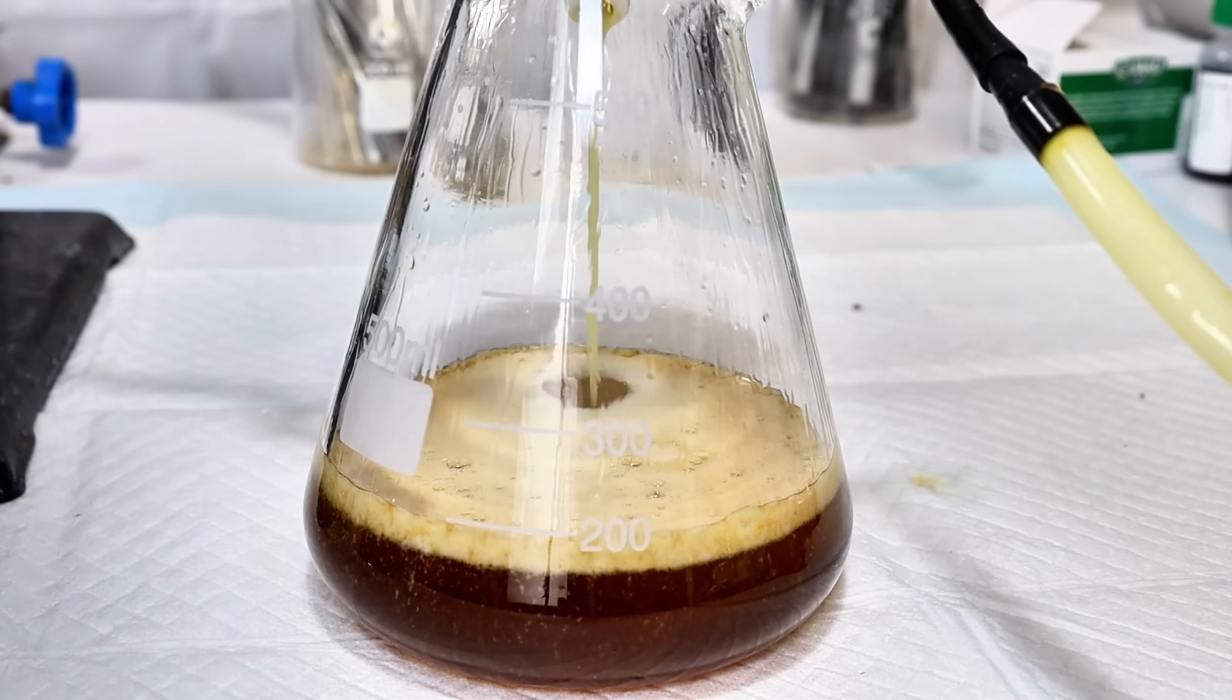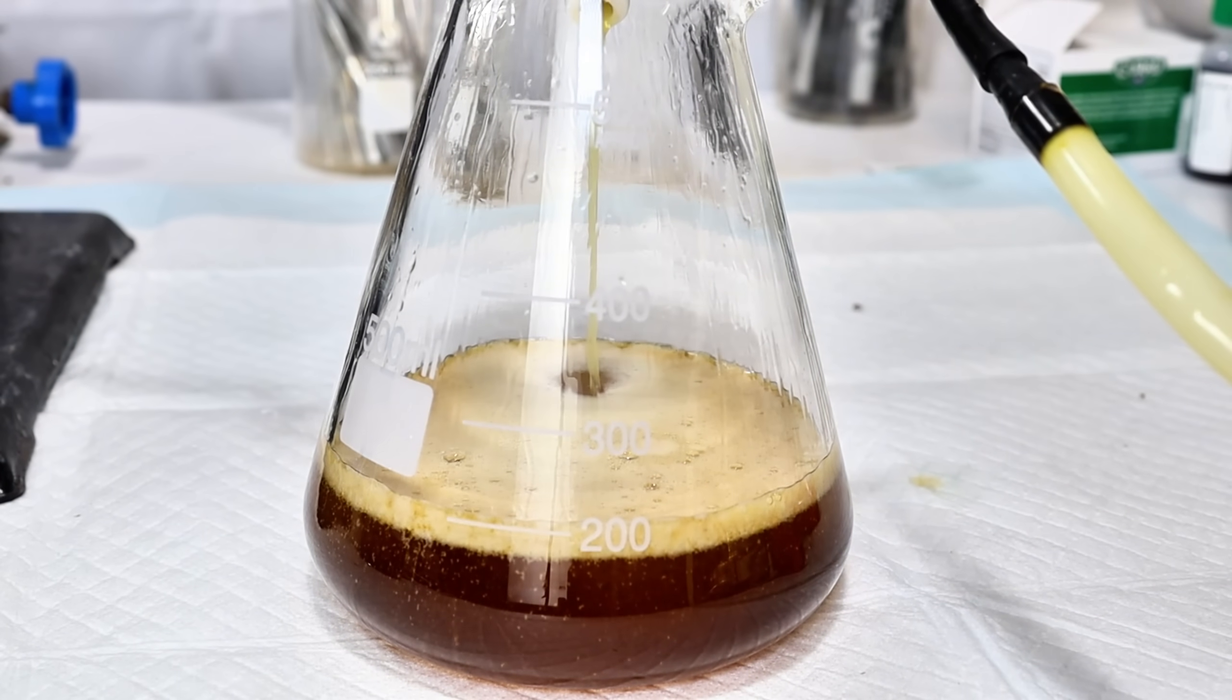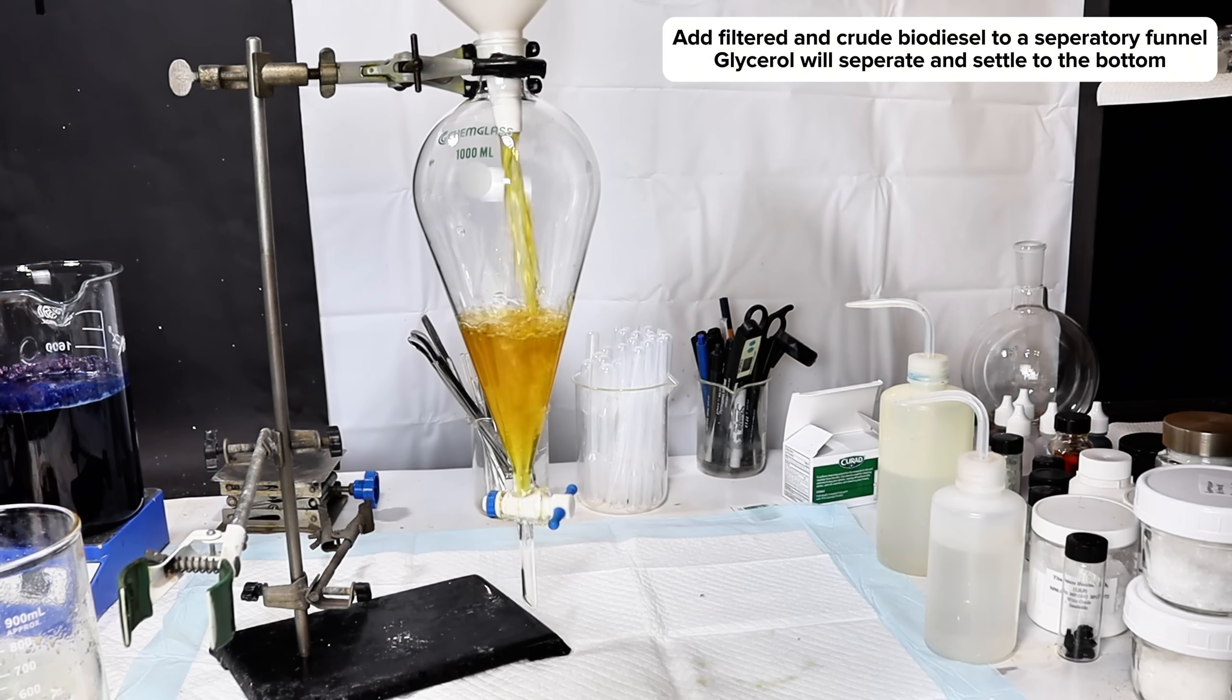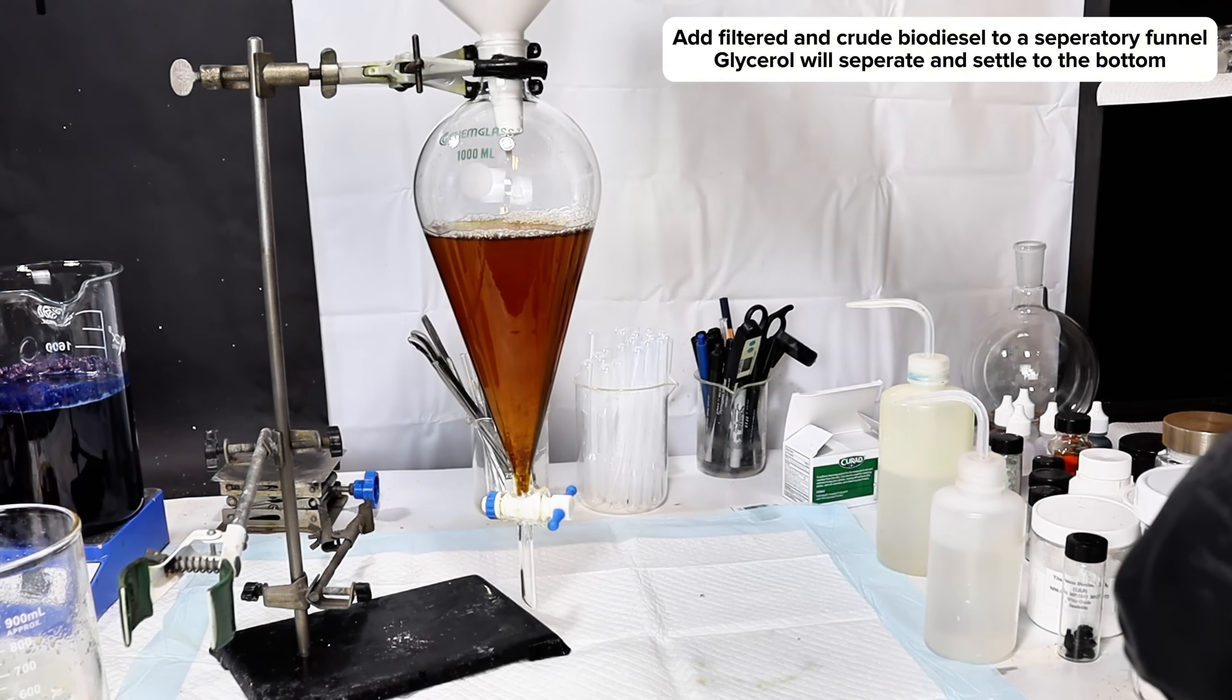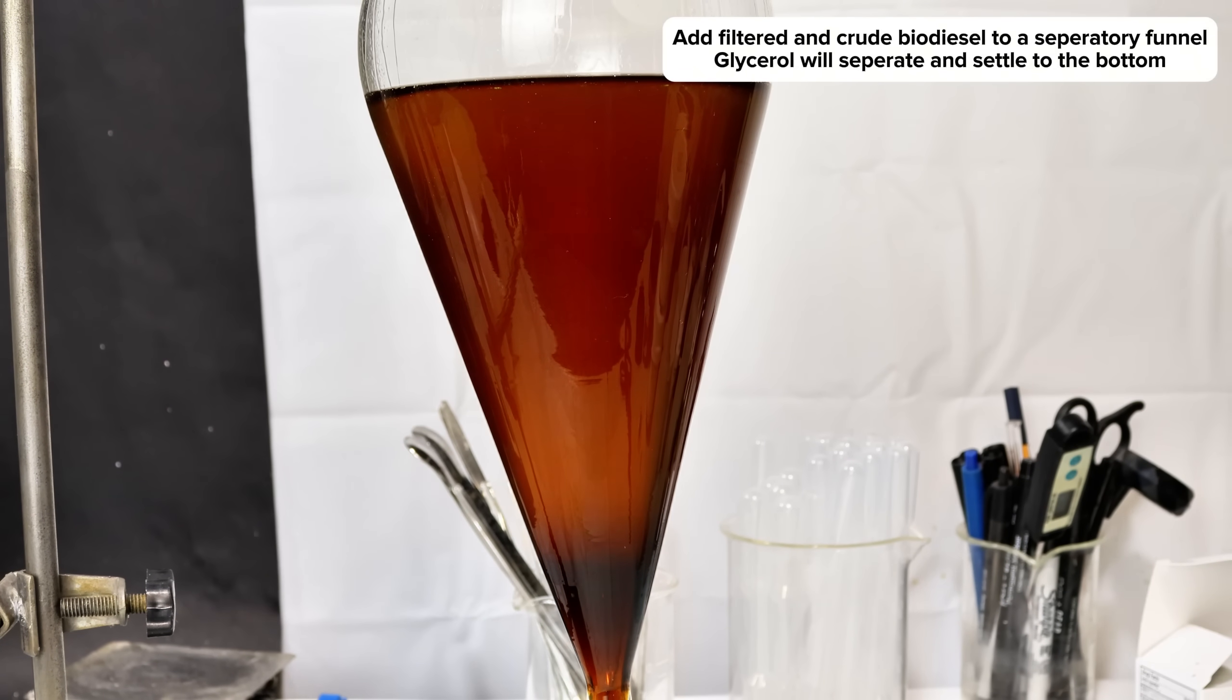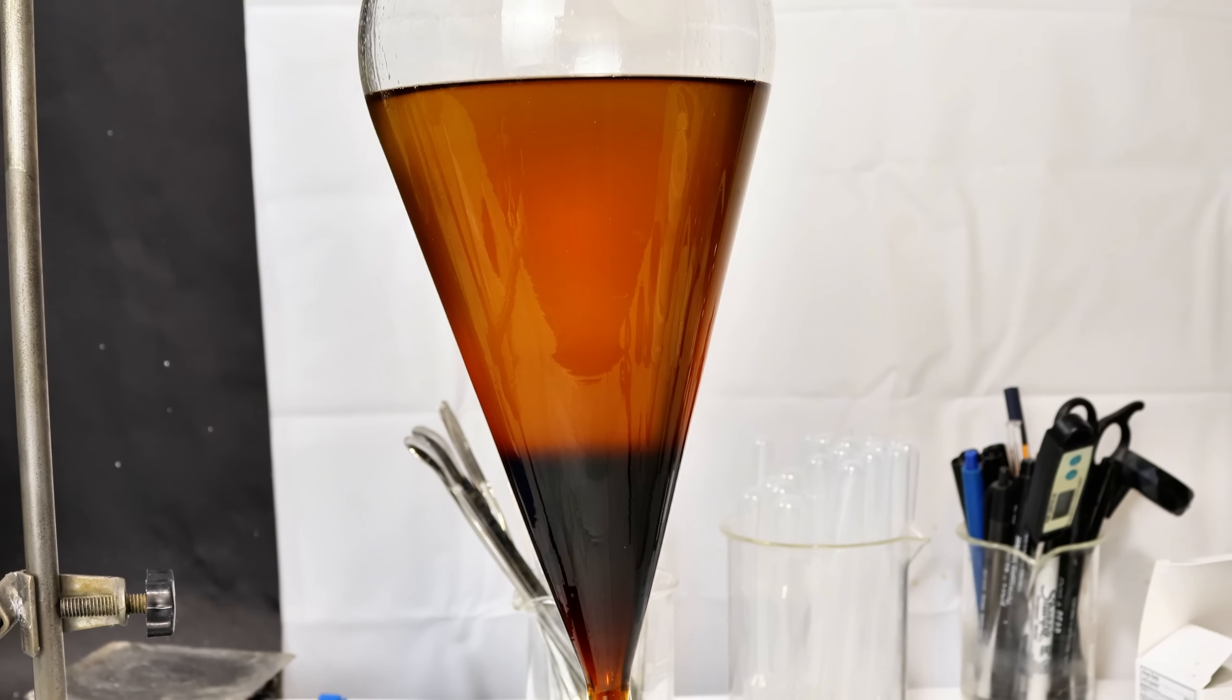So I took the beaker off the heat and passed the crude biodiesel through my Buchner funnel to remove all of the excess hydroxide. This was then transferred to a separatory funnel, at which point I left it overnight to allow the more polar and very dense glycerol to settle to the bottom.